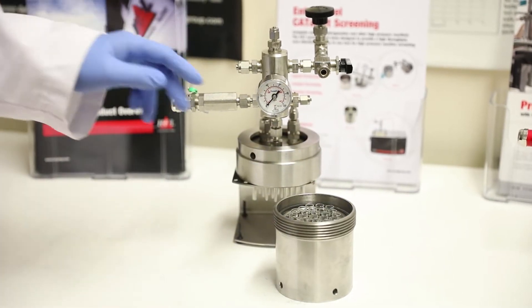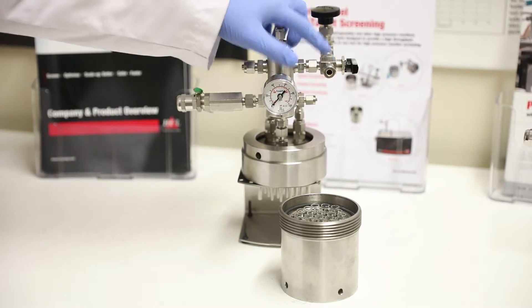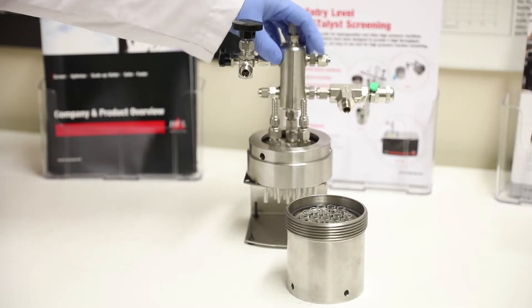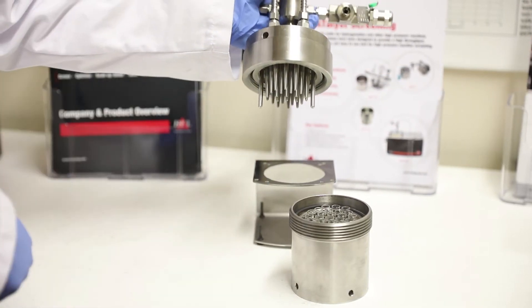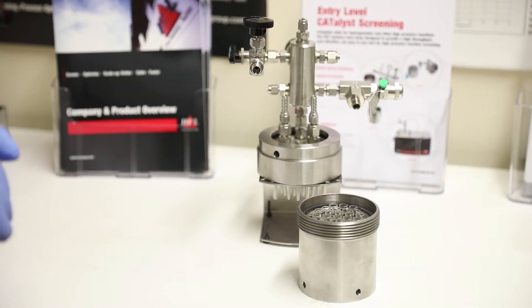Again, in the same way, we have similar manifolds — pressure gauge, relief valve, dosing valve, let-down valve, and a position for a thermocouple. And again with the CAT 24 we have a cooled head. With this we have pins which go into each of the vials, and those pins allow cooling and reflux in each individual vial.